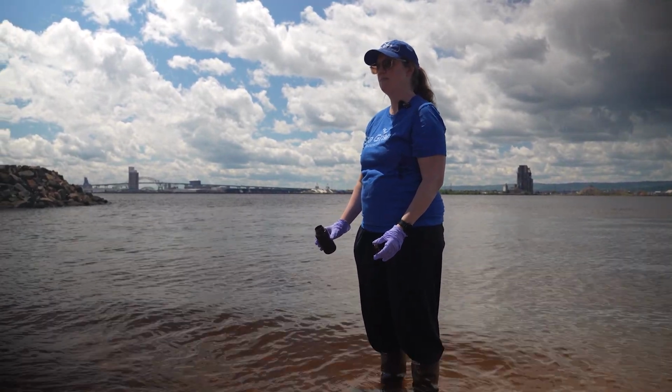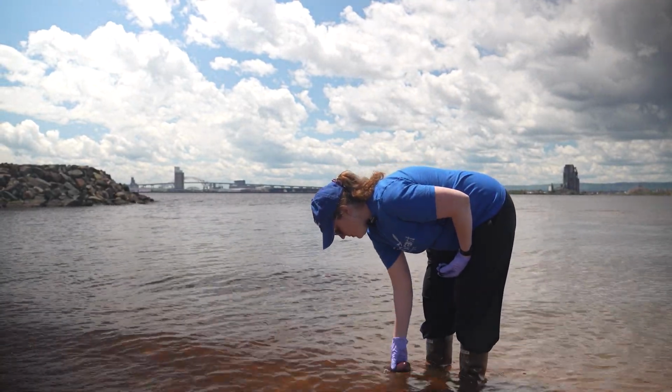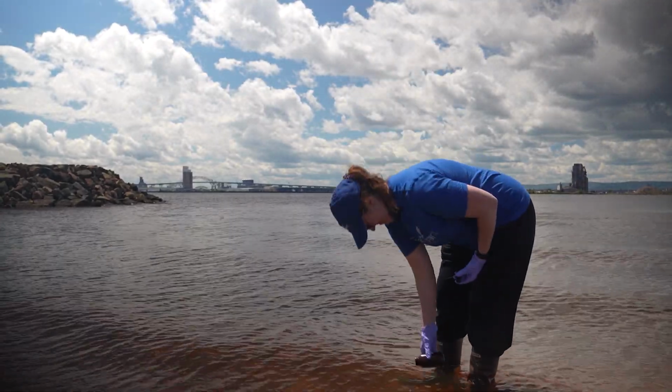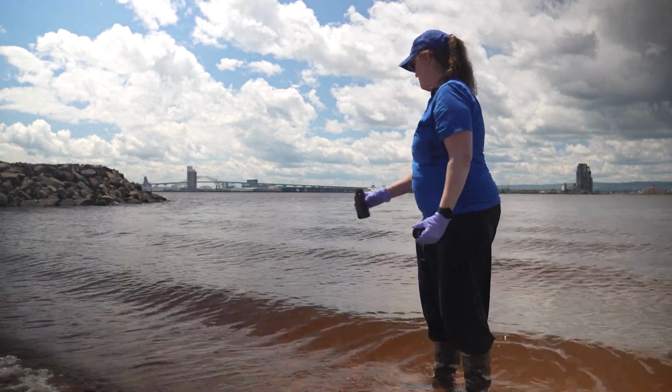So how we're going to do this is we're just going to dip the opening of the bottle right below the surface. And as we bring that up, we're going to swish it around a little bit, which Hilarie forgot to do, but she'll do this time. We'll swish it around a little bit and then dump the water.